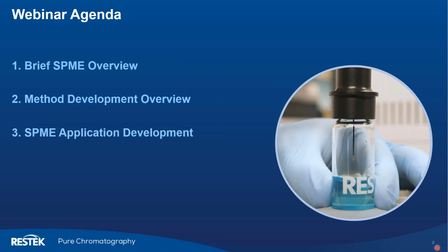Just a quick note on the agenda for today. I'll briefly be going over solid phase microextraction and giving an overview of the technology, dive into the method development and the critical parameters that we need to optimize, and then finally showing you some application work that we've done in the food and environmental sectors.